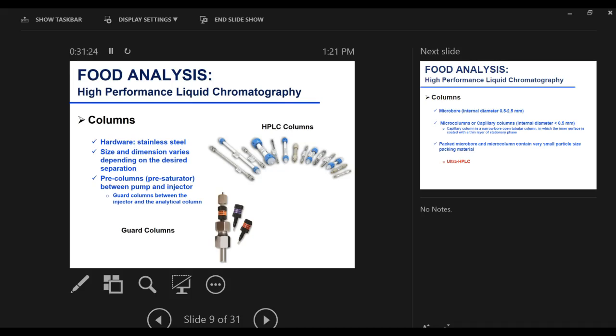If it is a reverse phase C18, it's capturing all components in your sample that are very hydrophobic and might bind irreversibly to your column. That means they might bind and block some functional groups, and if the functional groups are blocked, they are not available for your samples to interact with, so you lose efficiency.